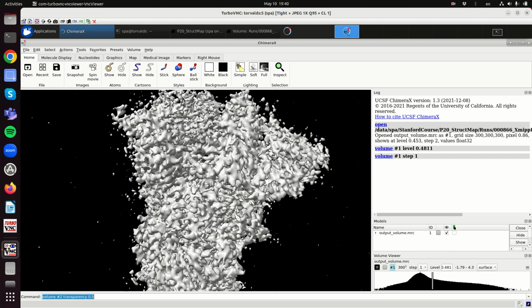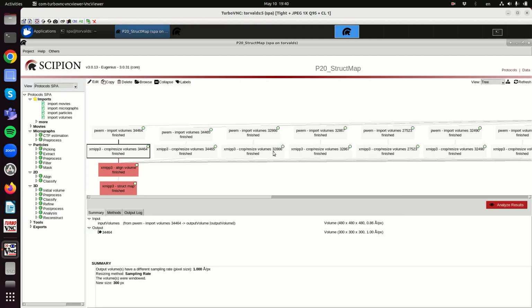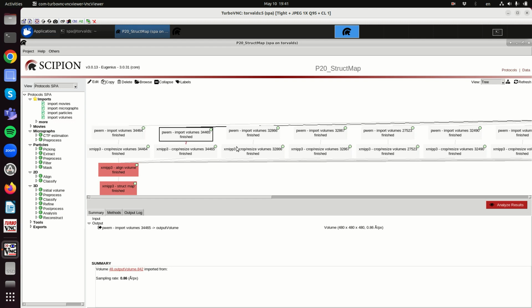Okay, so we see that some of them are already coming from the same study, so they have classified into different conformations. So for instance, maybe one up, these are from the 3 RBDs, or receptor binding domains. The 3 RBDs can be down, or one of them can be up, or halfway, or whatever.